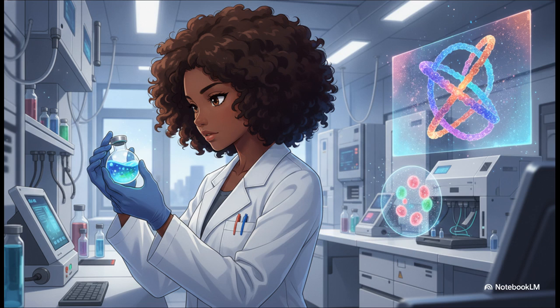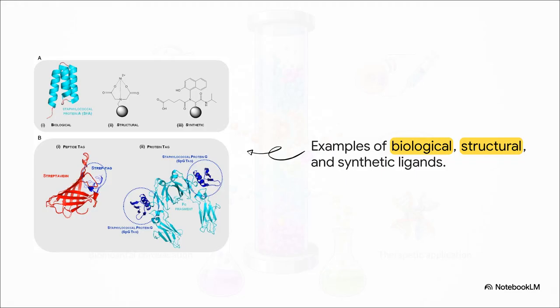And it's the foundation of diagnostic research, allowing us to prepare highly purified biomolecules for immunoassays, biosensors, drug discovery, and even large-scale vaccine manufacturing. And researchers are constantly tailoring these techniques for highly specific tasks. We don't just use biological ligands like staphylococcal protein A for capturing immunoglobulins anymore. We also engineer structural ligands. Think of the metal chelators used in immobilized metal ion affinity chromatography, or IMAC, which capture His-tagged recombinant proteins. We're even developing synthetic, biomimetic ligands that are highly resistant to degradation, which is opening up even more scalable purification options for the future.